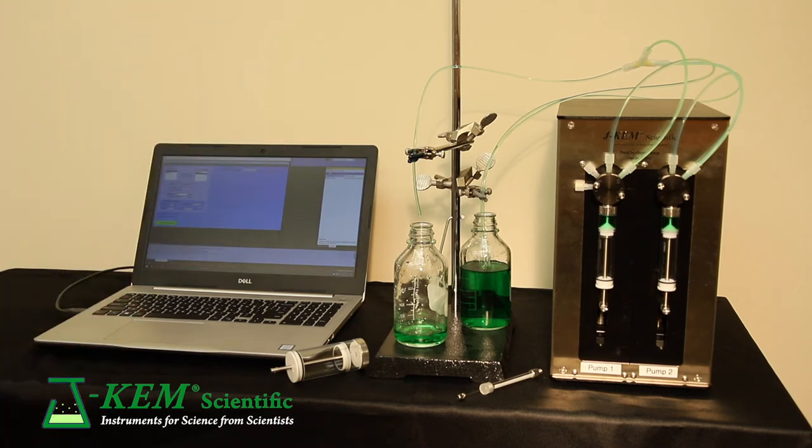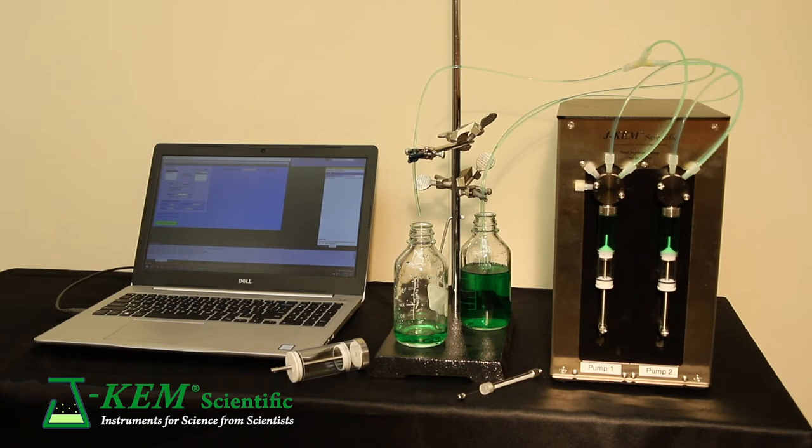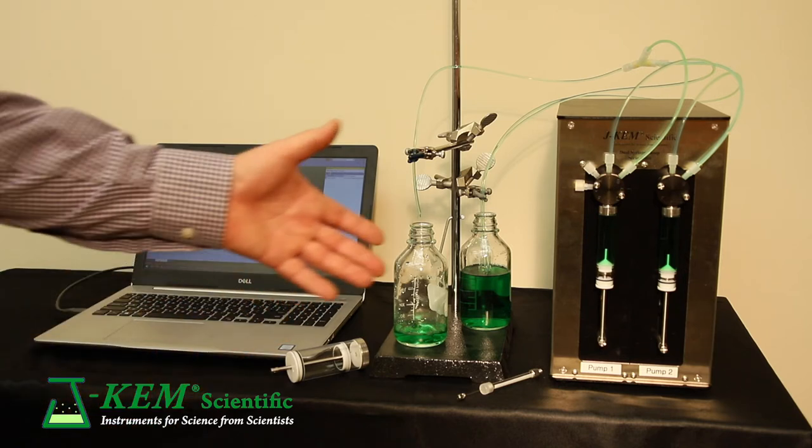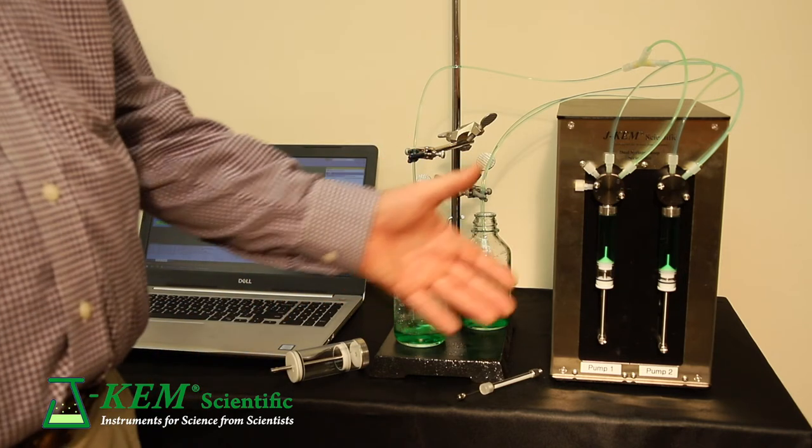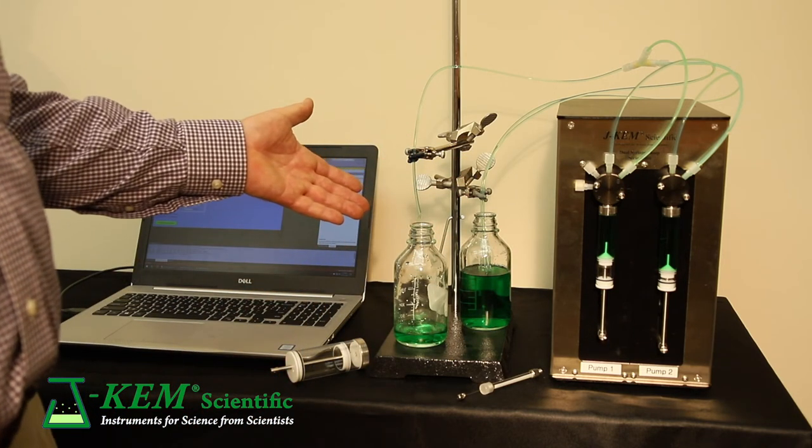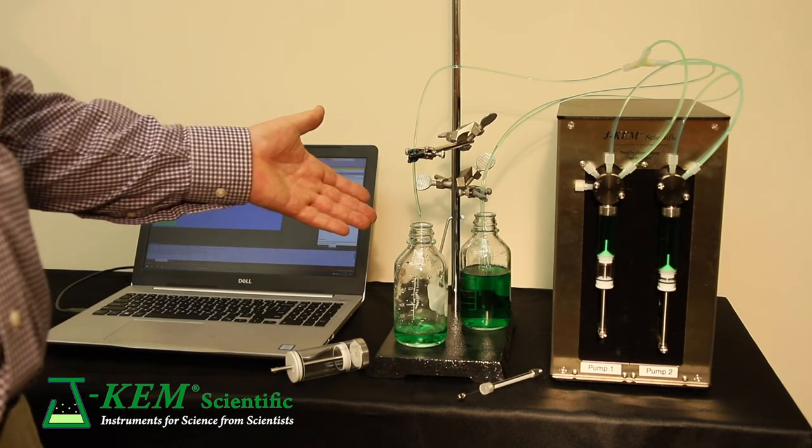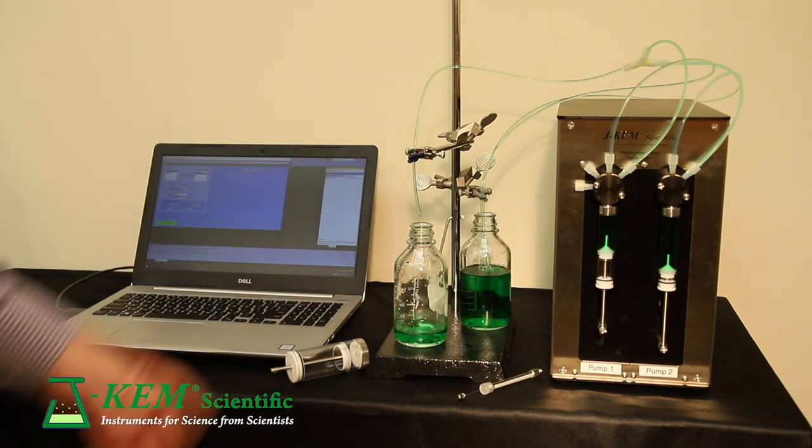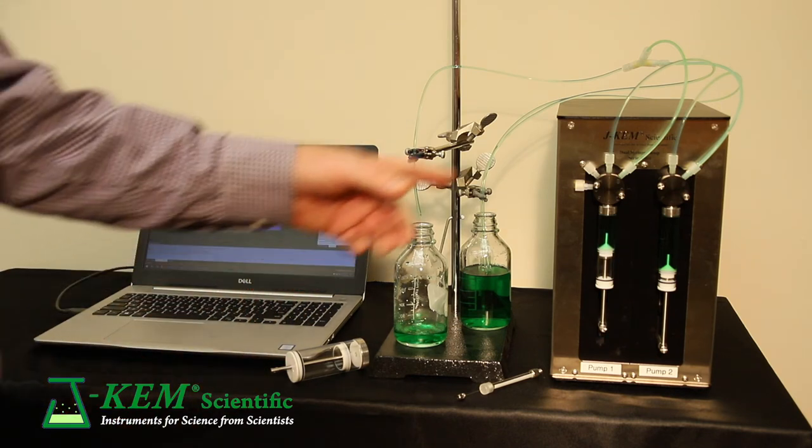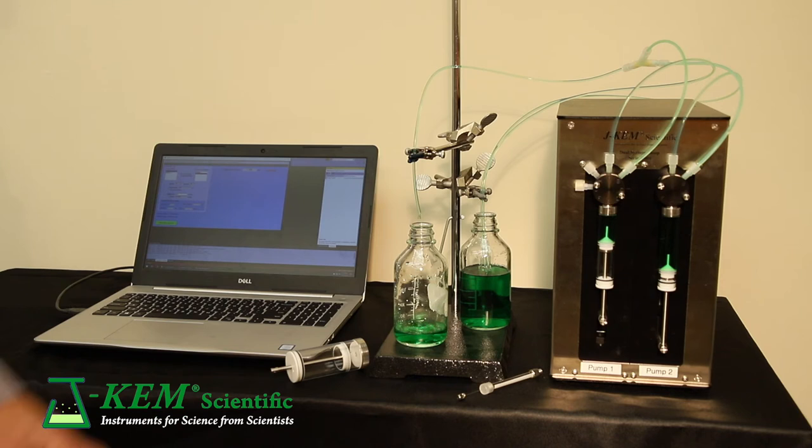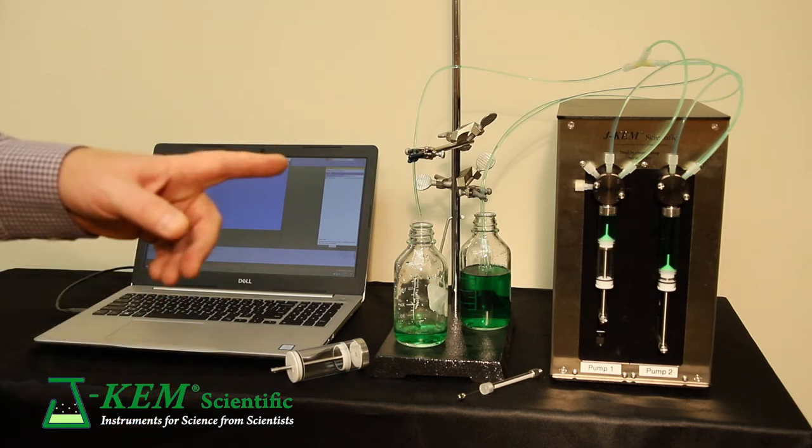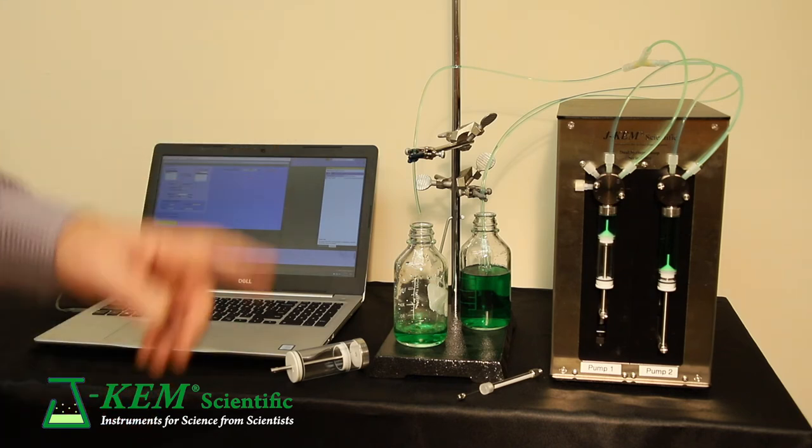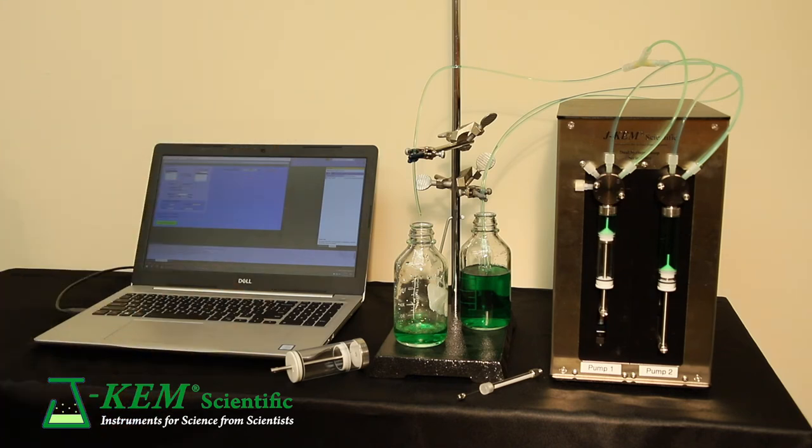In the dual pump system, both syringes, of course, are going to fill. Once they're full, syringe one starts to deliver at the rate I requested, 10 milliliters a minute. And it'll do that until it's empty. Now, the important point here is watch what happens when syringe one is empty.